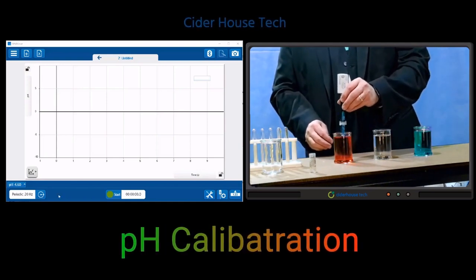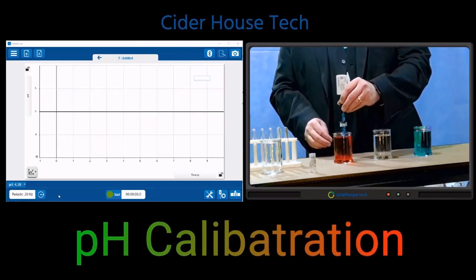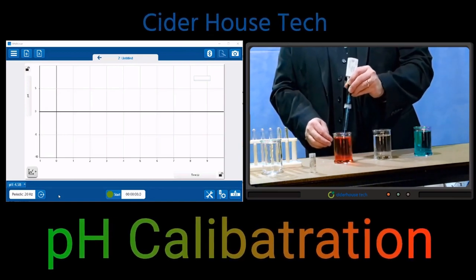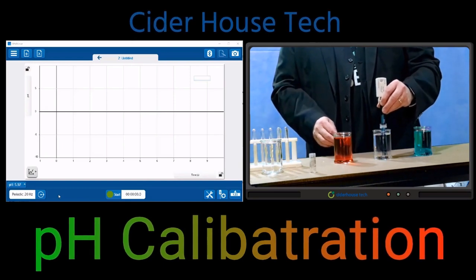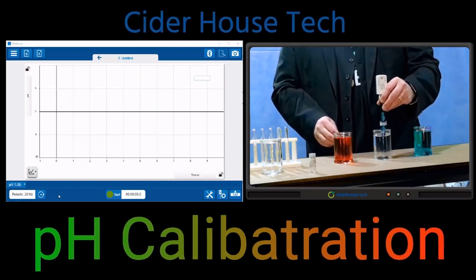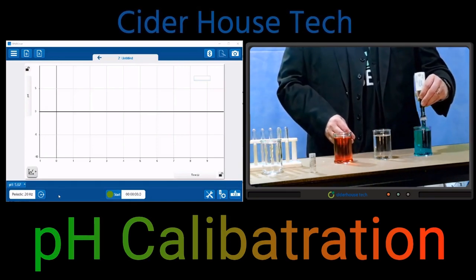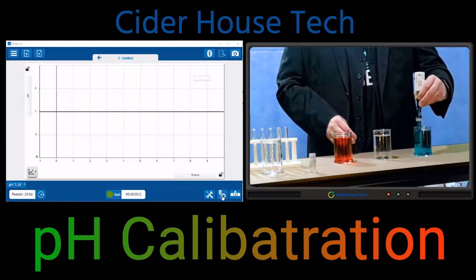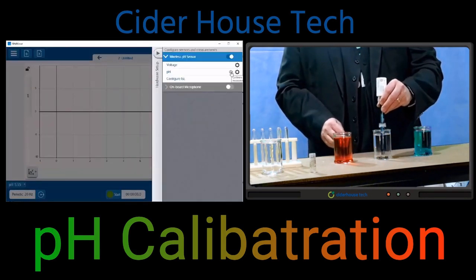I've previously paired a pH sensor to my occurrence of SparkVue. I'm now going to remove my pH electrode from its storage bottle and then briefly rinse the electrode and then pat dry briefly, very gently, with a paper towel to remove any of the excess water. Going to access my calibration menu by selecting on the hardware setup menu and then selecting the crosshairs to the left of the gear on the line with the pH.